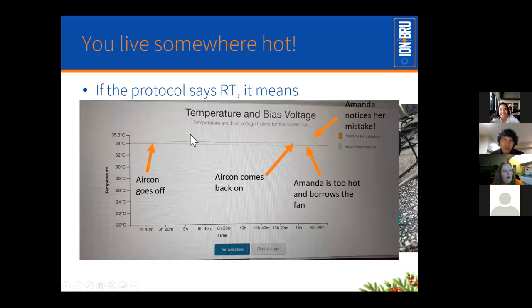We actually put it on quite late in the day, and this lab does not have air conditioning overnight. So this is the point where the air conditioning turned off that evening, and you can see it was a little high. It wasn't too bad, but it did struggle to maintain its temperature. So in the morning, the aircon came back on, and then poor British me arrived after a 40-minute walk in the sun to the lab, and I was absolutely roasting.